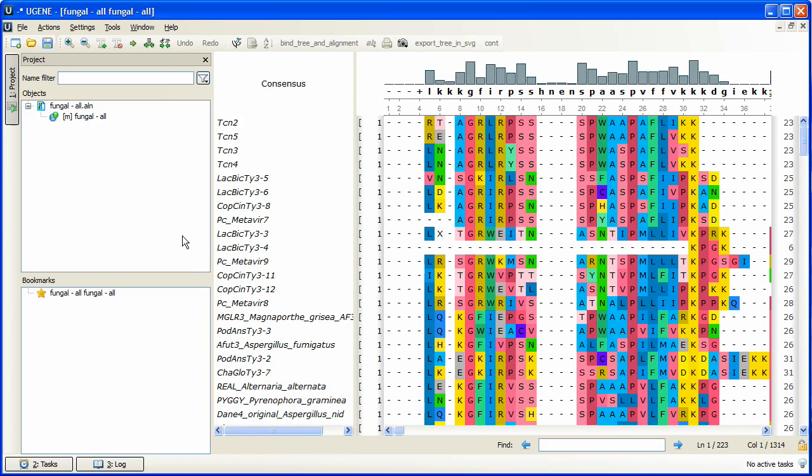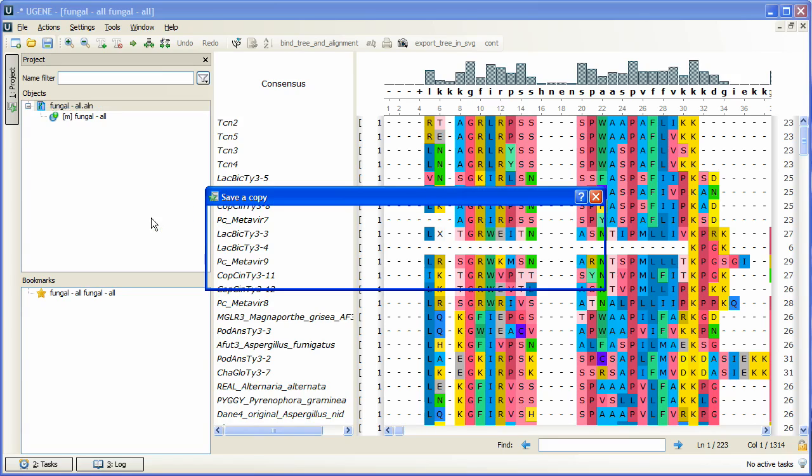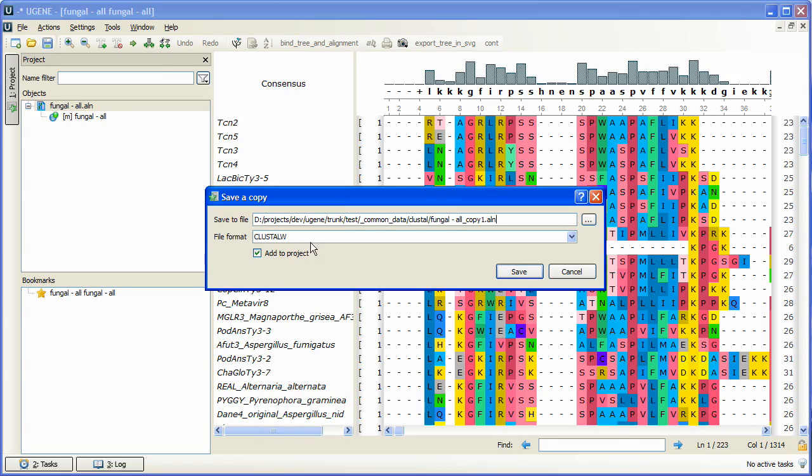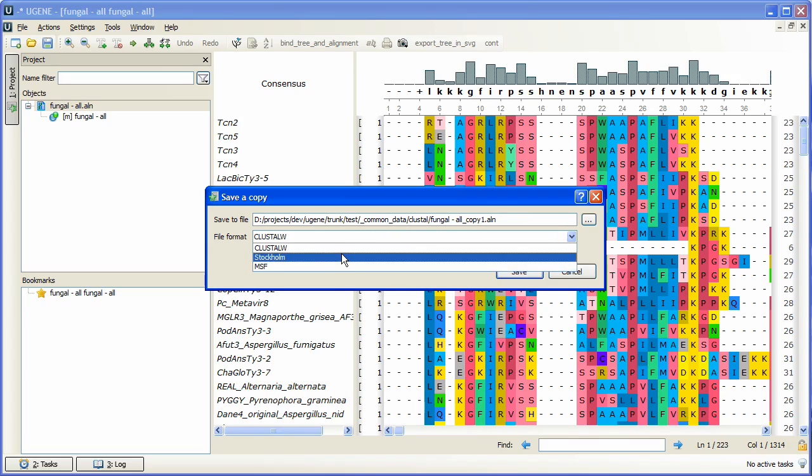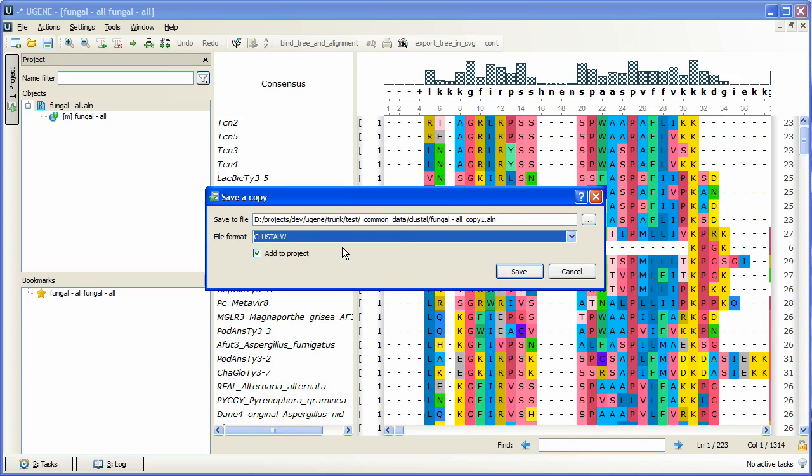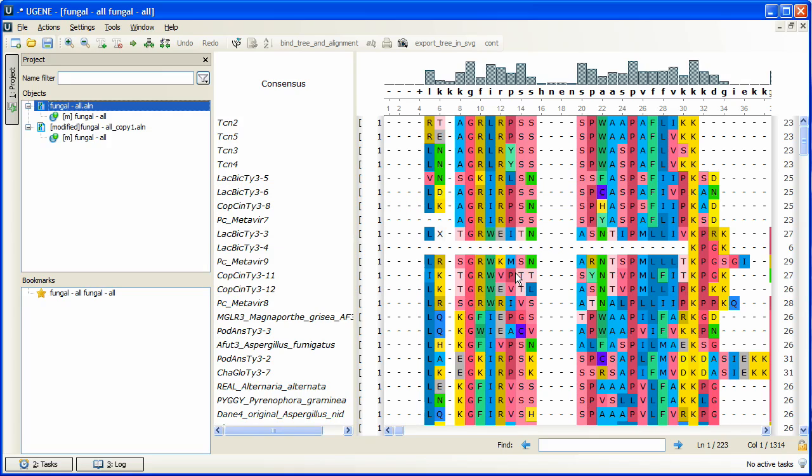Let's make another copy of the file to make different alignments of it within one project. To do this, we right-click at the document name from the current project view and select Save a copy. In the dialog box, we choose automatically created file name, clustal W file format, and we will add the new file to the current project. Click Save. The document has been successfully copied and opened in the current project view.